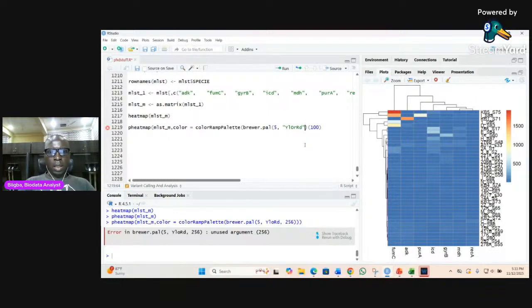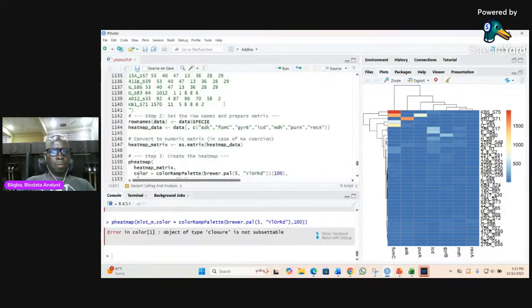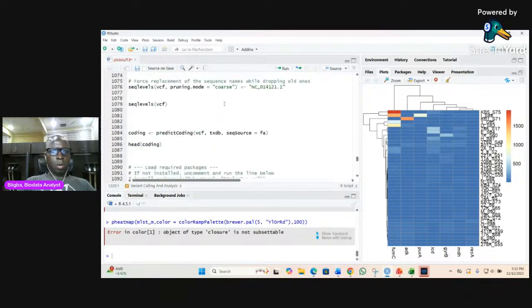I don't need this. Or yeah. So maybe I may rather need it at the end here. I'm sure I need some comma here. So I'm just trying to get the code in order. I think, yeah, so let me get back there and see if I can. I keep getting that code wrong all the time.